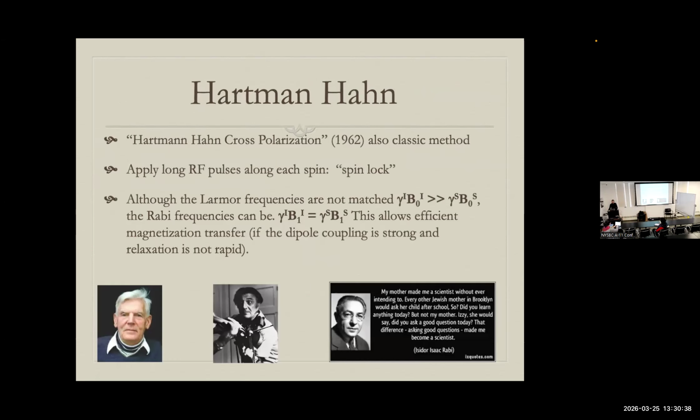Okay, so finally, this whole sequence that we're going to focus on here, where you have the two spin locks, now we're going to start to dig in on it and understand why it's working. So we talked about this pi pulse train only because it's a little bit more intuitive for the first glance. People feel comfortable with it, even if there's no Hamiltonian to go with it. But now I want to talk about a pulse sequence we use every day that works differently than that because it's based on the spin locks, so the CPMAS. And for this one, we're going to dig in with some formal Hamiltonian treatment.